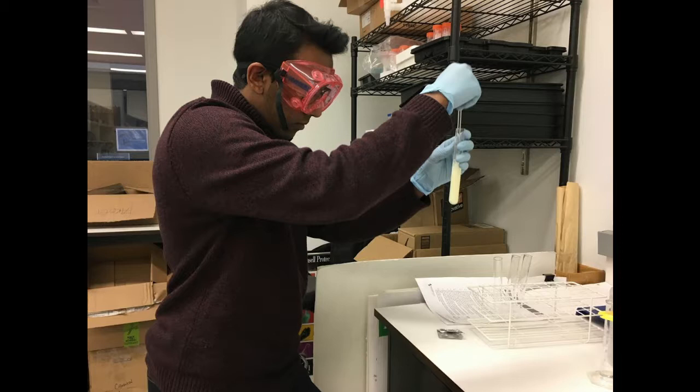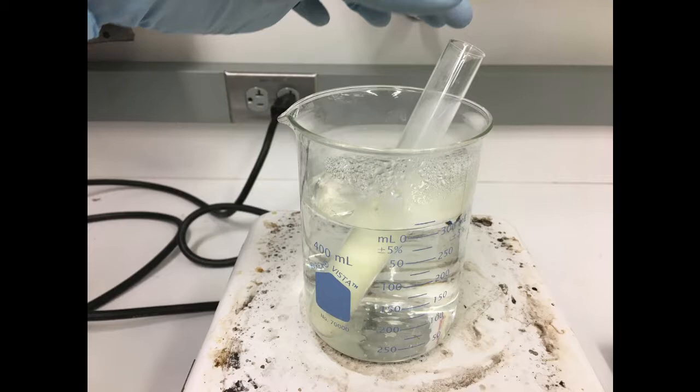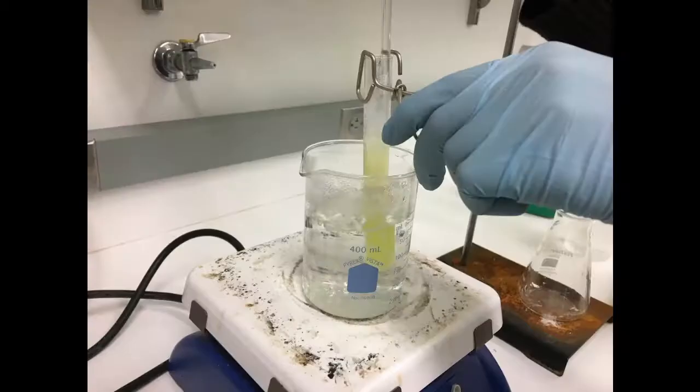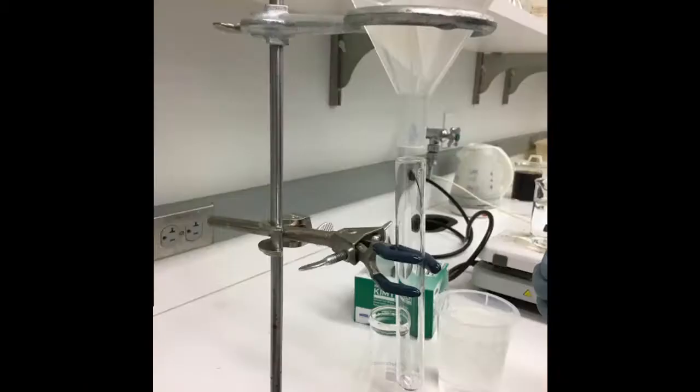Make sure to mix the test tube contents either by vortexing or, in this case, a glass stirring rod. Once you mix the contents of the test tube, place it into a hot water bath while it is heating to a boil. Frequently stir the solution with a glass stirring rod in the test tube while it is being heated.